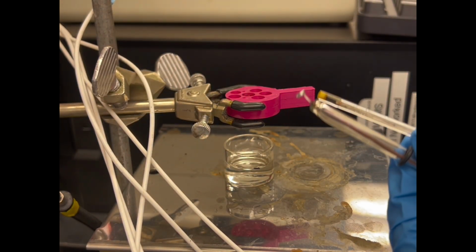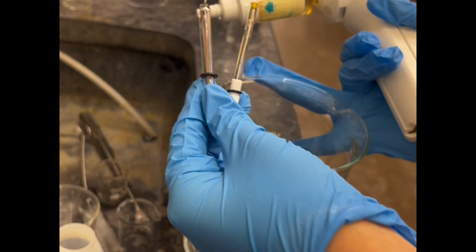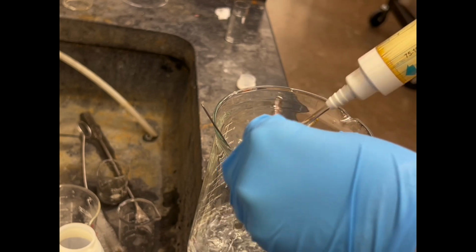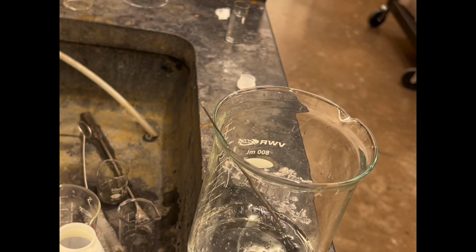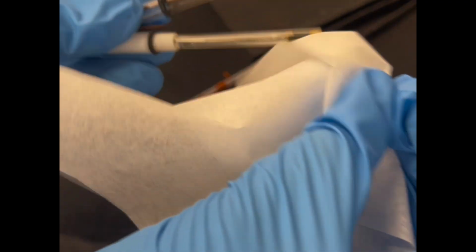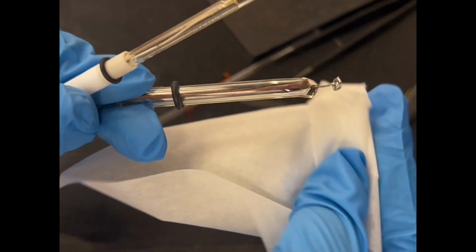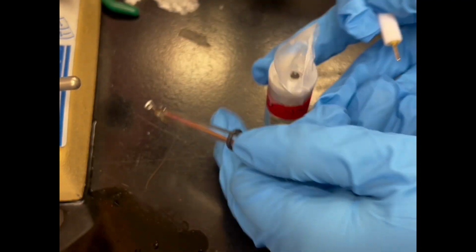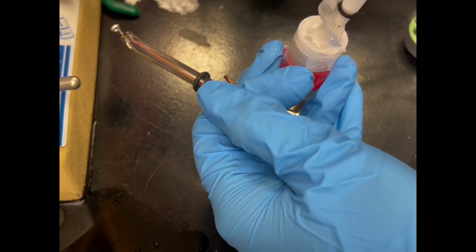We take them out of the solution used and rinse them in the waste beaker with the pure water to clean the solution we used before. And we wipe it with the Kim wipe. And we will put the reference electrode back because we want to keep it wet. But for the counter electrode, we could just hang it on the plastic cell for later use.